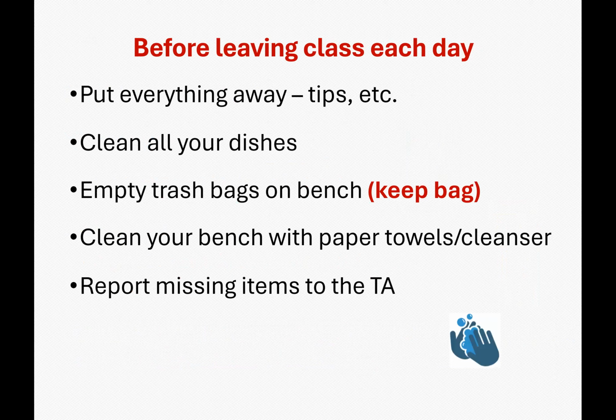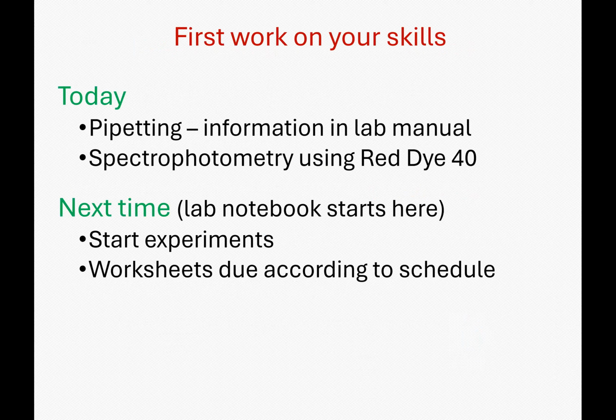Before you leave class each day, make sure you clean up, put everything away, empty your trash. We give you paper towels and cleanser to clean your bench, and let us know if anything is missing.